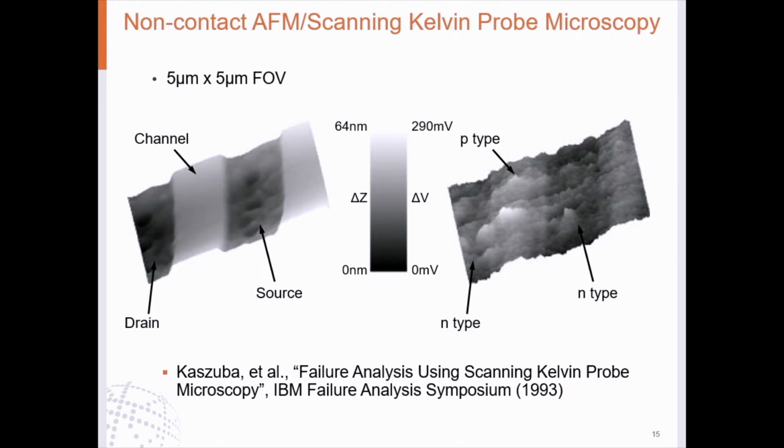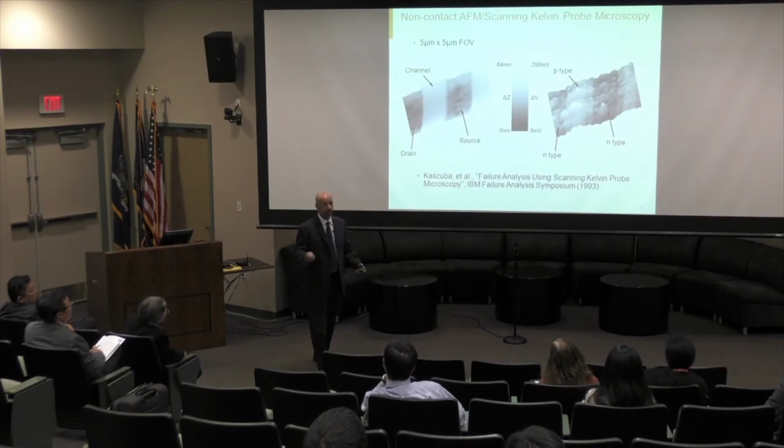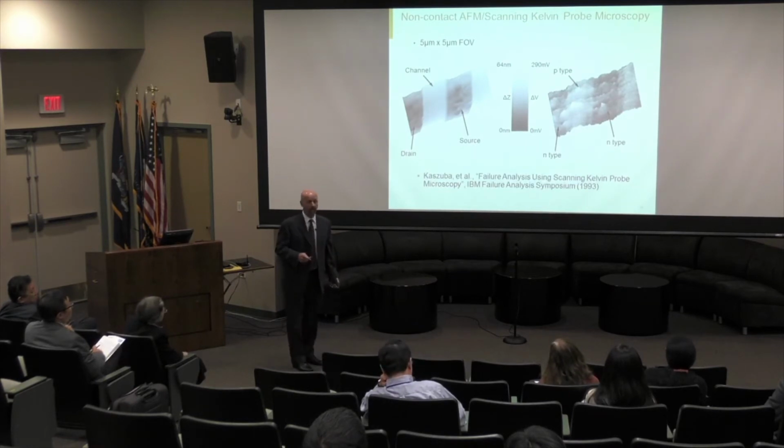This was groundbreaking at the time, because using a non-chemical technique, we were able to image this device, and we were able to understand where the N-type silicon was, where the p-type silicon was, and where some very specific features were in this device. It's a very noisy image, but it got us into the next phase of where we needed to go in terms of device analysis.